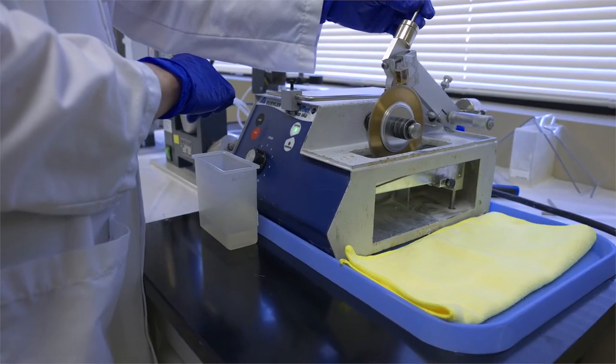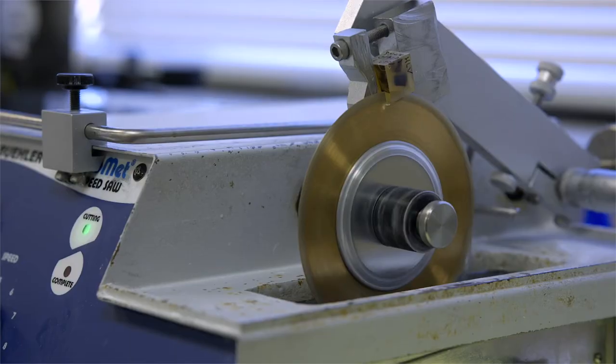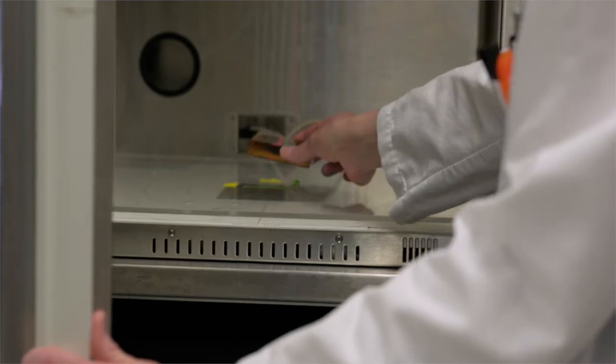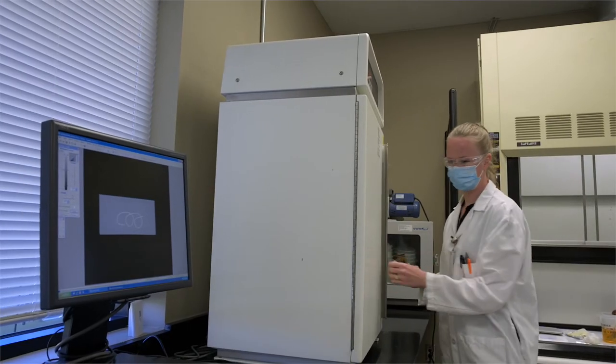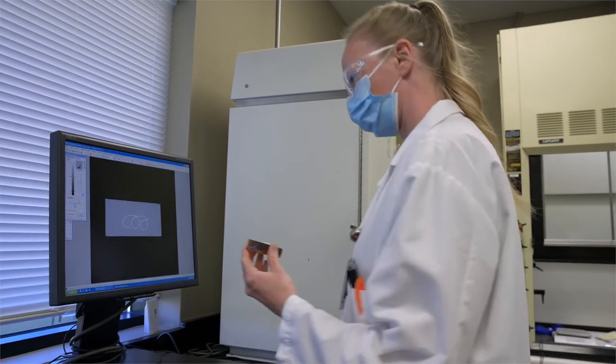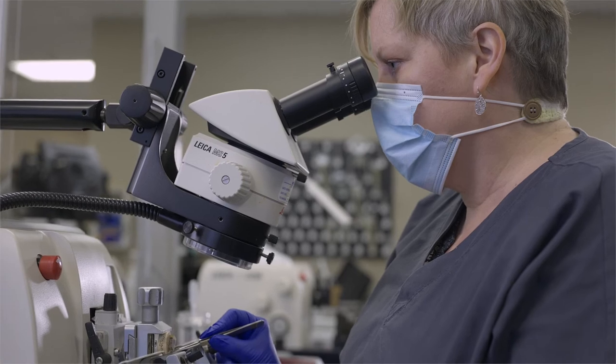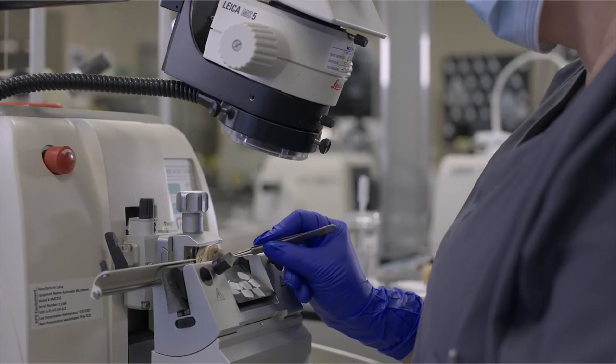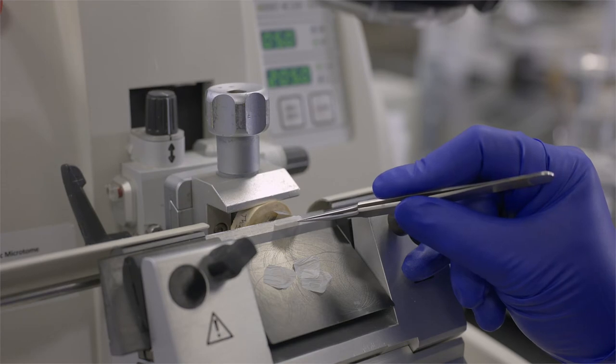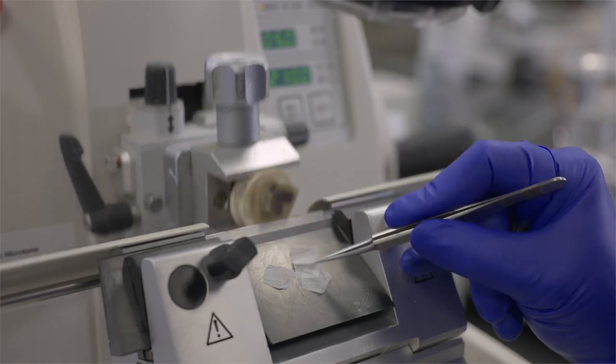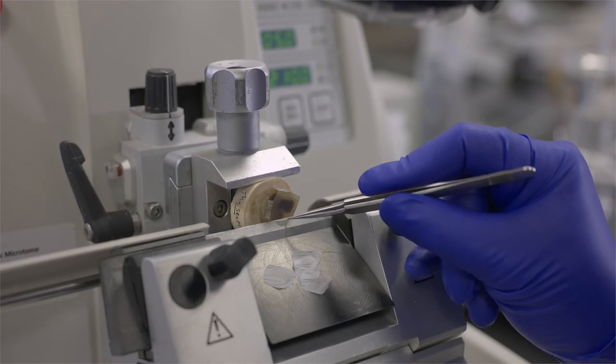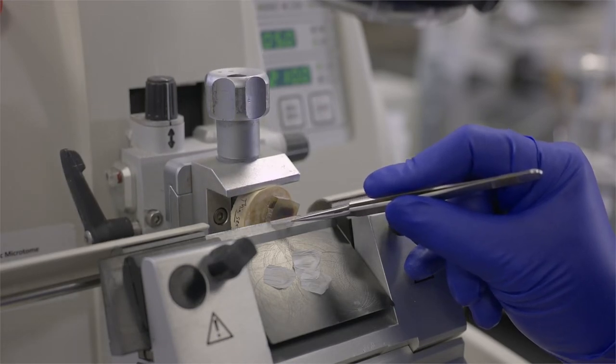Small embedded samples are now made into blocks using an isomet low speed saw with a diamond blade. An x-ray cabinet can be used to assist with determining cut lines. The blocks are either cut on a microtome, these are called thin section plastics and are cut at 5 microns, or they are ground on an exact grinder system to a thickness of 40 to 70 microns. We will go more in depth with the exact samples later.